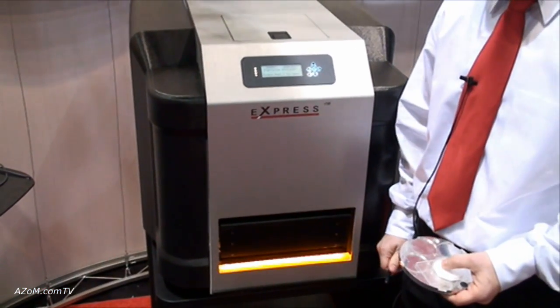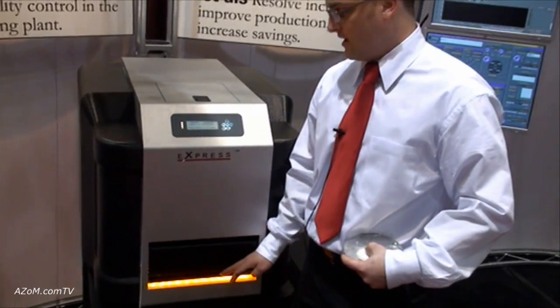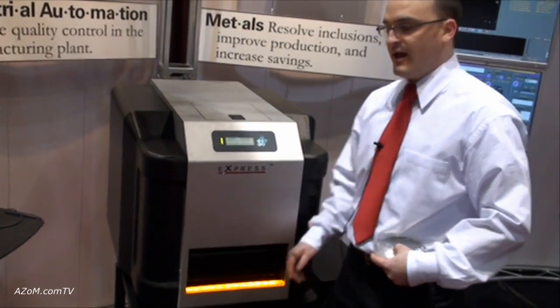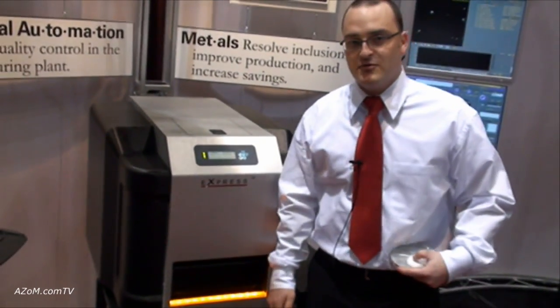As the chamber pumps down, the color on the machine changes to indicate what stage it's at. Once the orange lights turn green, that's an indication that the software is ready to be utilized and you can analyze your samples.